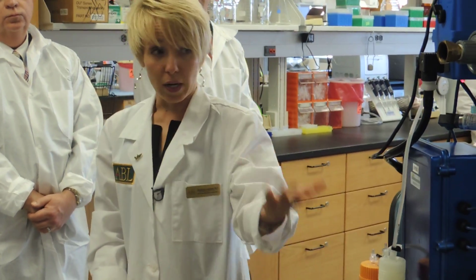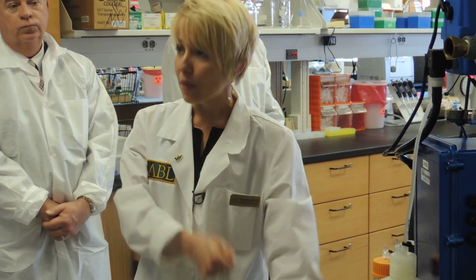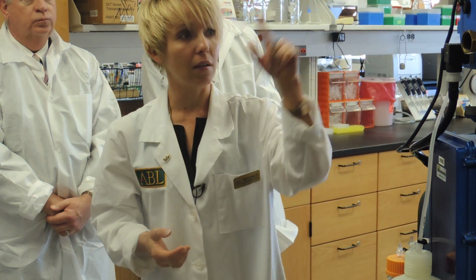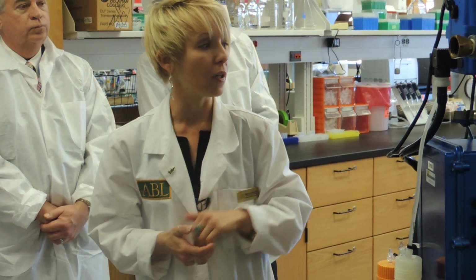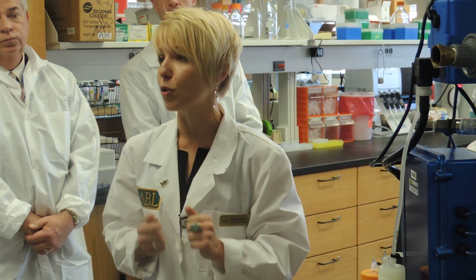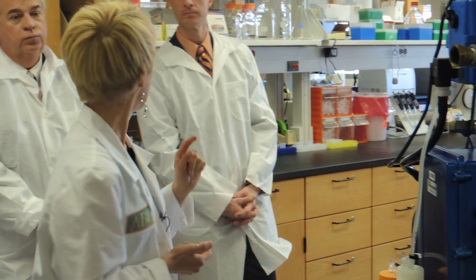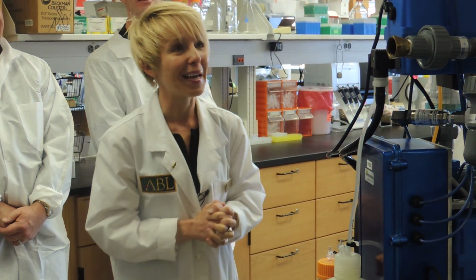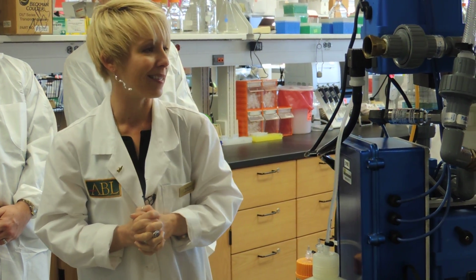Yes, ma'am, and that includes transport, getting it out of the car and back in the car. The platform, the computer, as well as some of the other transport carts actually fit in the trunk of our graduate student's car. You have a what kind of car again? A Nissan Altima. So it doesn't take up a whole lot of space. It's easy to transport around.